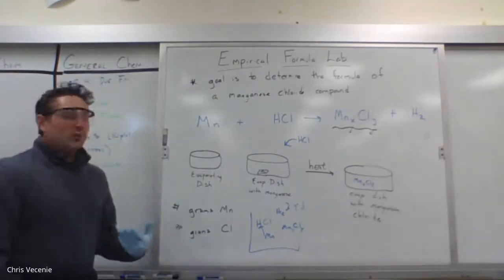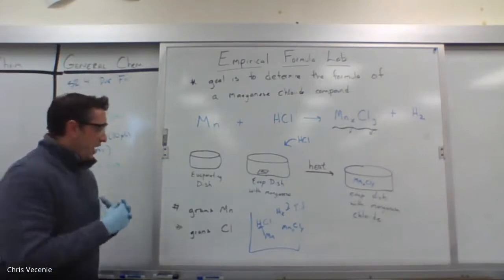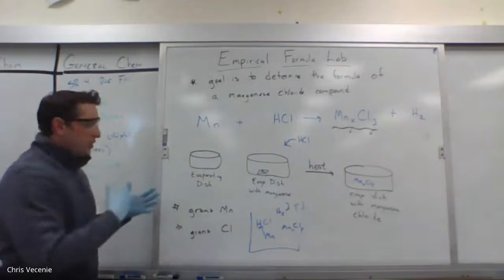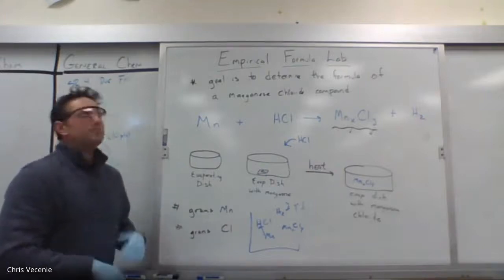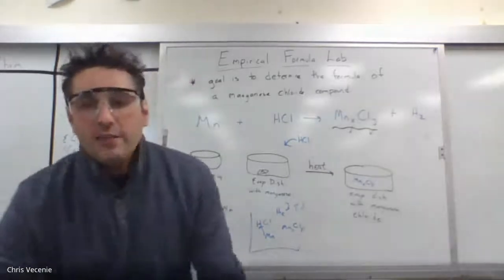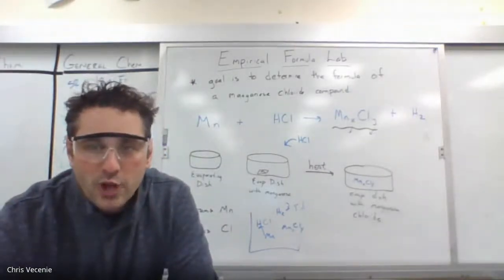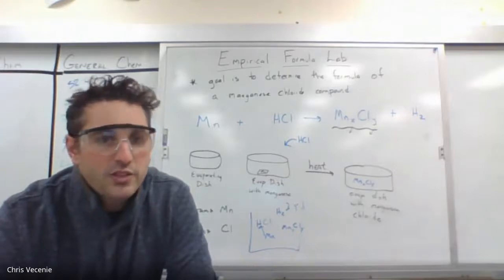I can show you those setups while we're waiting for it to dry to get rid of the HCl. But let me walk you to the back and start getting some of our initial numbers so that you know how to fill some things in. Like if I share my screen with you, and I promise I will stop sharing it when I start doing the math so you can see.